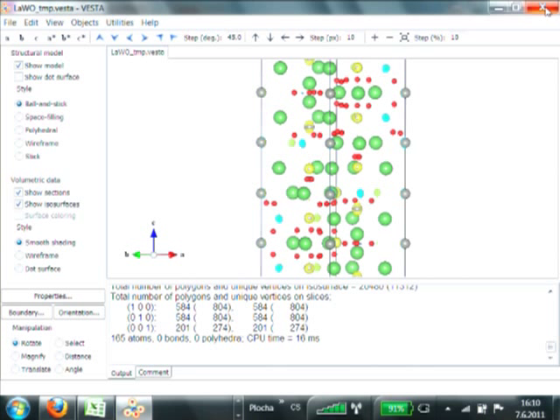Okay, but in this case, when you just said you have these 3 elements, will the program then automatically, let's say, the strongest third of the peaks is lanthanum, then tungsten, then oxygen, or how is it doing it? The program integrates the charge around each peak and then scales it, comparing the integrated charge with the atomic number. You find the best scale, and then you say, okay, after scaling, this charge is closest to lanthanum, so it's likely to be lanthanum. This is closest to tungsten. So it's using the integrated charge around every peak. Thanks.